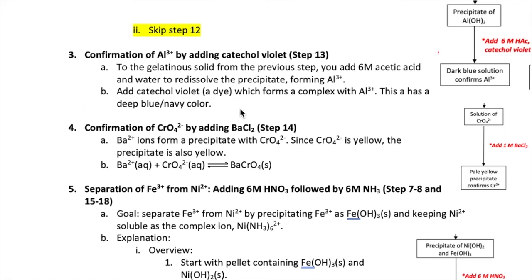Lastly, we will confirm that chromate is present by adding barium chloride to the supernatant that you had from step 11 earlier. The barium ion will react with chromate to form a yellow precipitate, which is barium chromate in this reaction shown here.